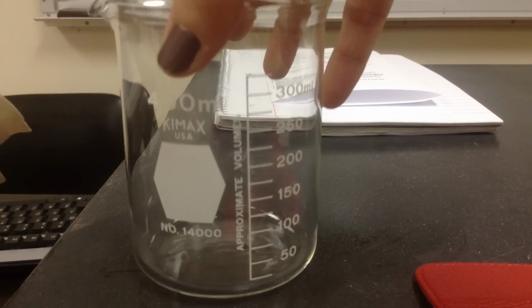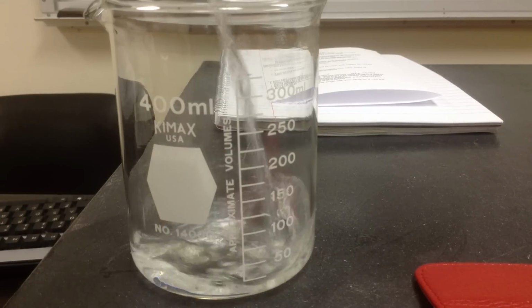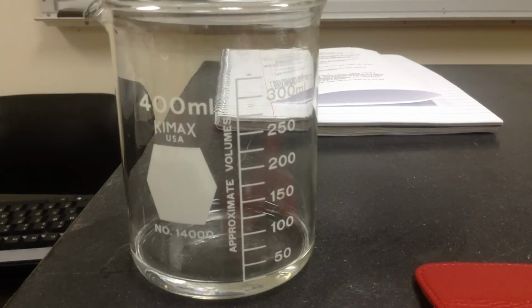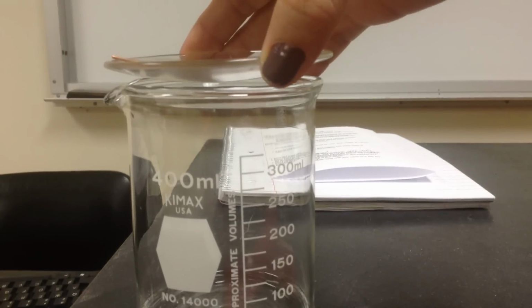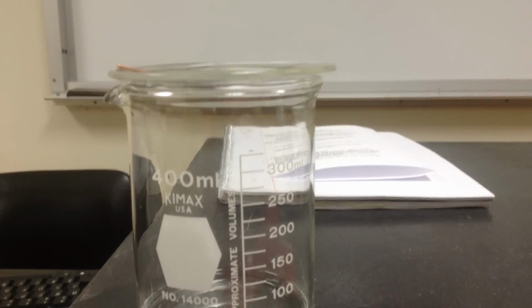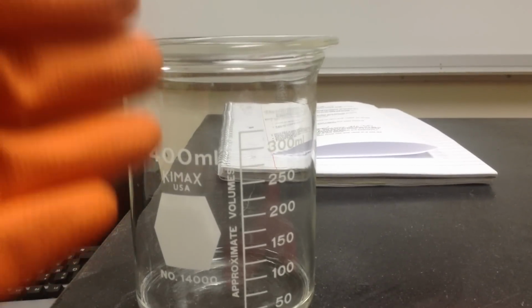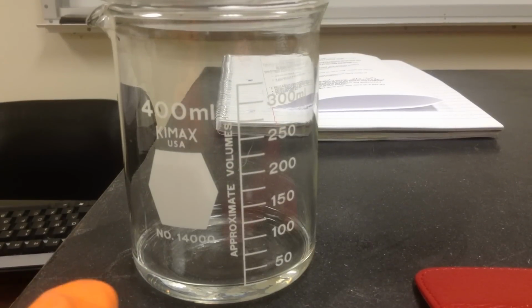That is a 400 milliliter beaker. And place the watch glass on top of that. And then find the mass of this whole system. So this is everything that's involved in the reaction, the copper and the nitric acid.